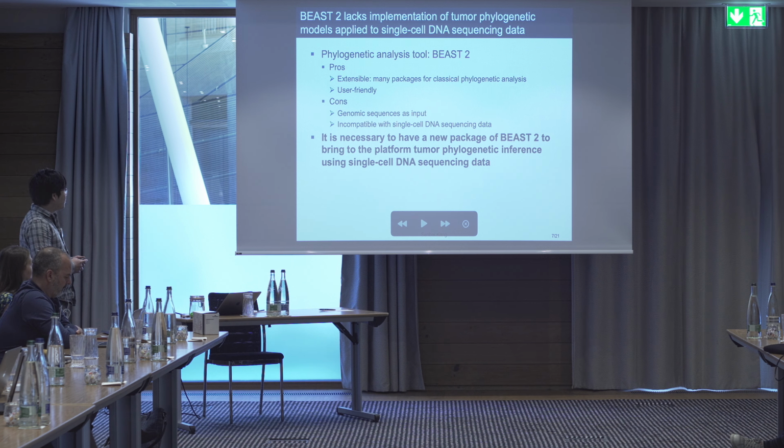But it also comes with many disadvantages. First of all, it always requires genomic sequences as input, and it is currently still incompatible with single-cell DNA sequencing data. So it is necessary to have a new package of BEAST 2 to bring to the platform tumor phylogenetic inference using single-cell DNA sequencing data.